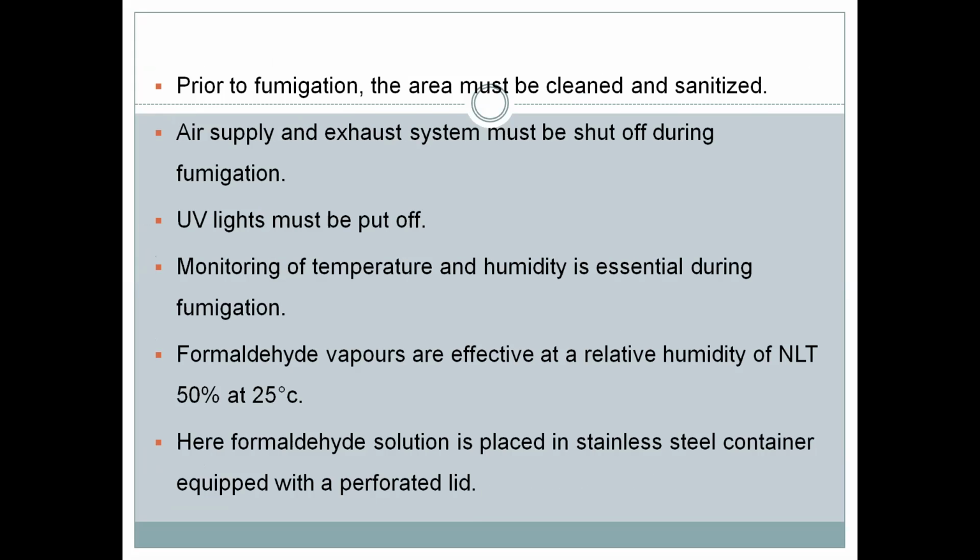Prior to fumigation, the area must be cleaned and sanitized. Then the air supply and exhaust systems are shut off during the fumigation. Both the air supply and the exhaust systems should not be working, and the UV lights should be off.